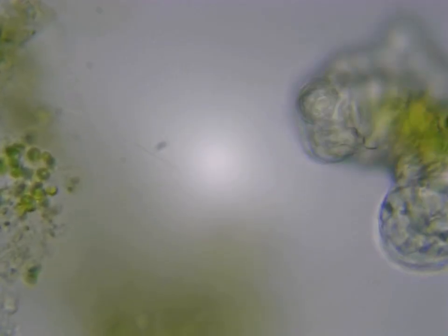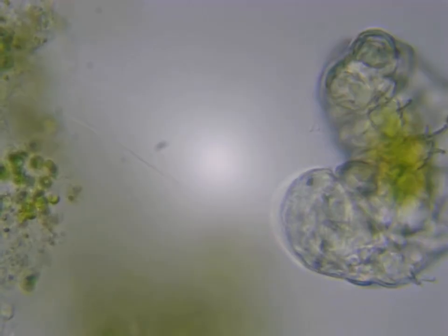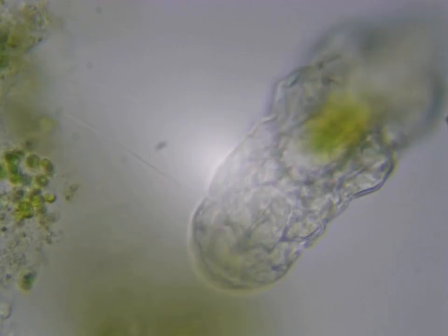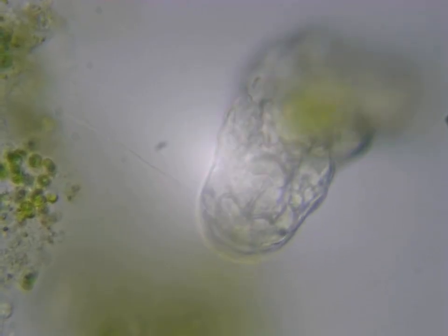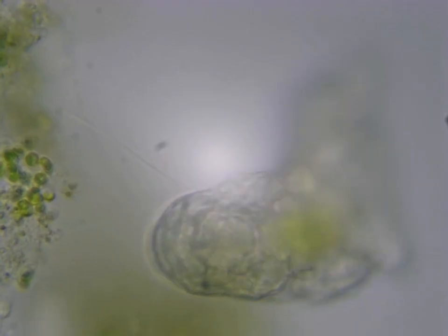The ability to survive in extreme conditions is the hallmark of tardigrade biology. This phenomenon is called cryptobiosis, where tardigrades enter a state of suspended animation, effectively stopping all metabolic processes. When faced with unfavorable conditions like extreme dehydration or freezing, tardigrades retract their limbs and curl into a ball, forming a tun. During this state, their metabolism drops to near zero, and they lose almost all of their water content.